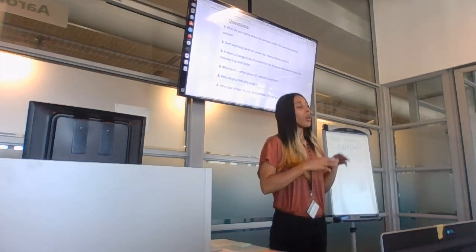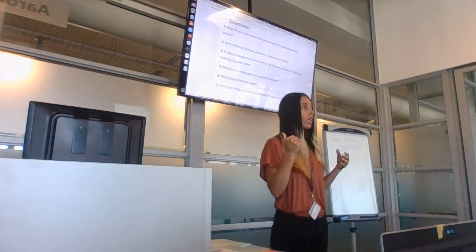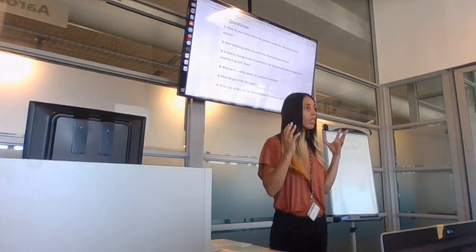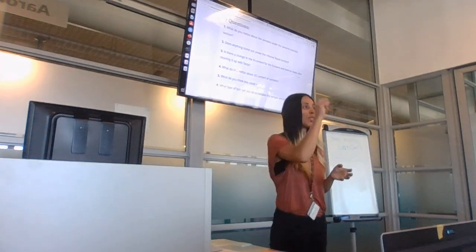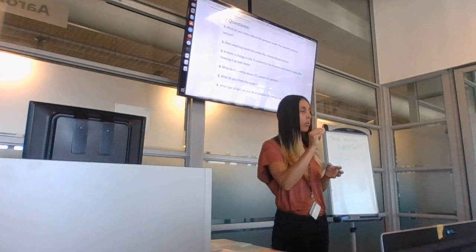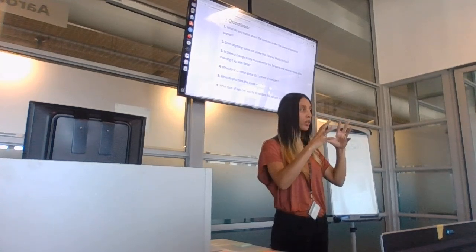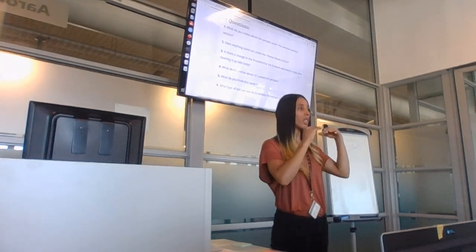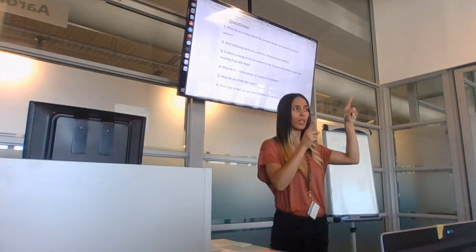MultiQC, you only use if you've got many samples. You will see the report now. If you have 100 samples, you could click on the FastQC result for each file if you have a lot of time. But MultiQC aggregates all of the FastQC results and structures the report so that you can have an overview and instantly see that a sample looks different to these ones.